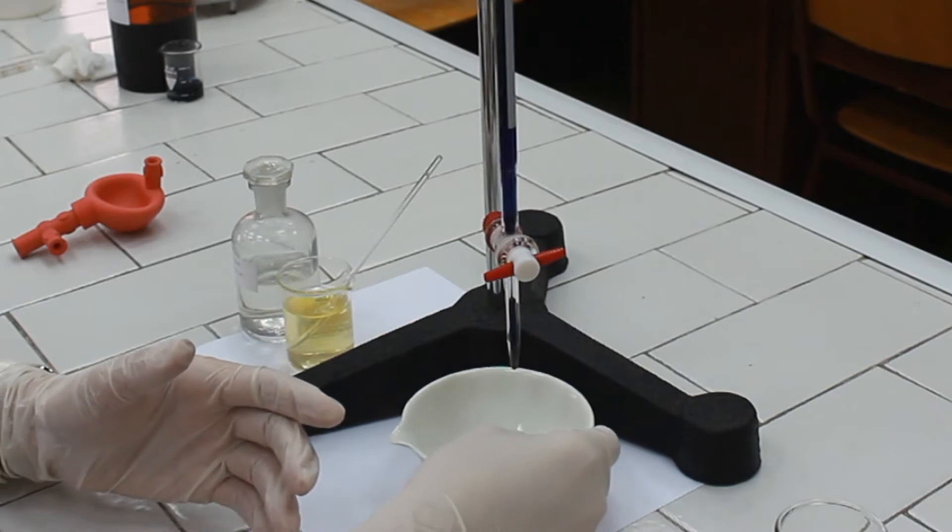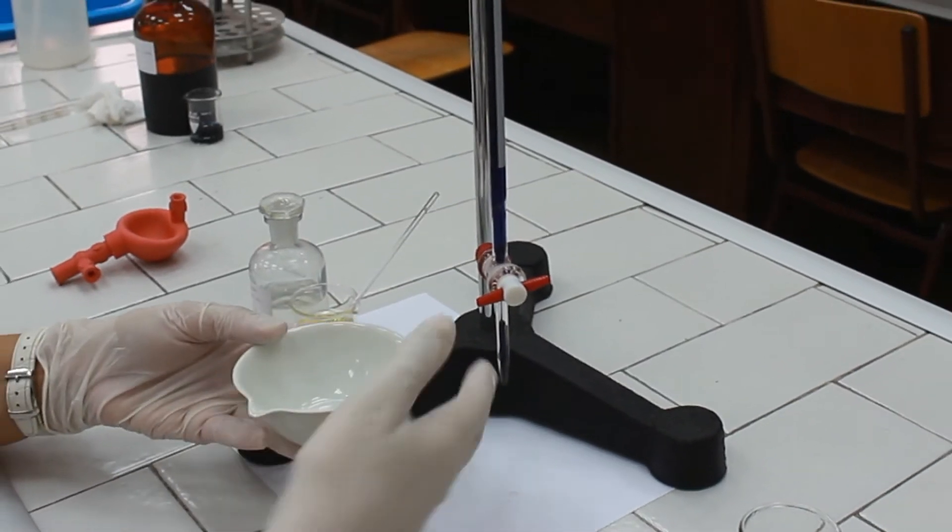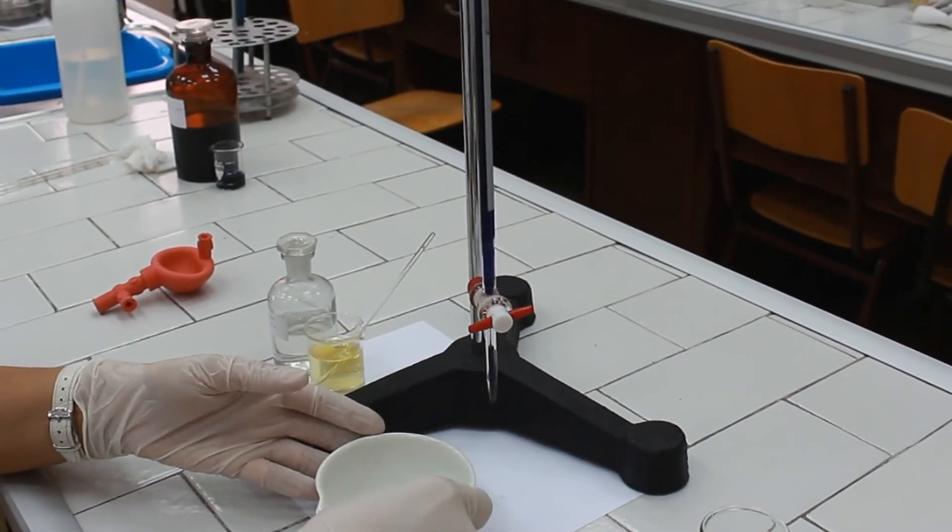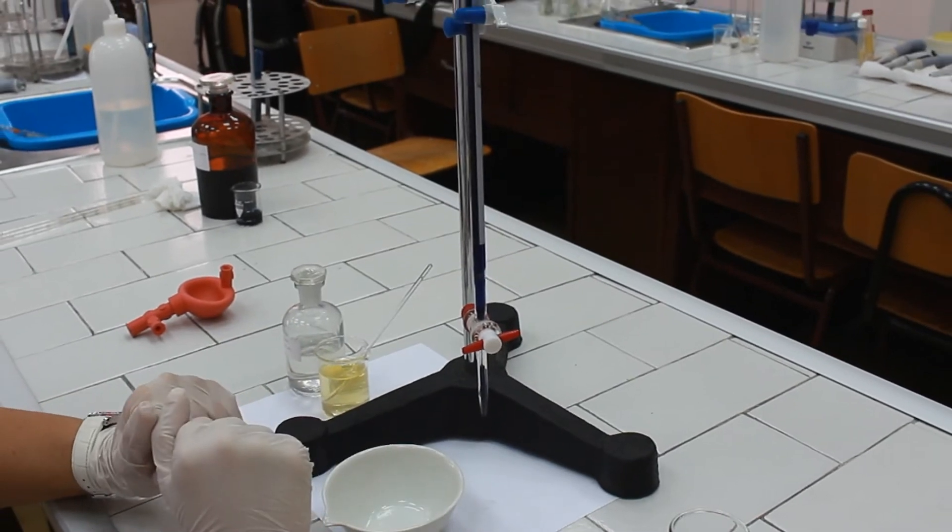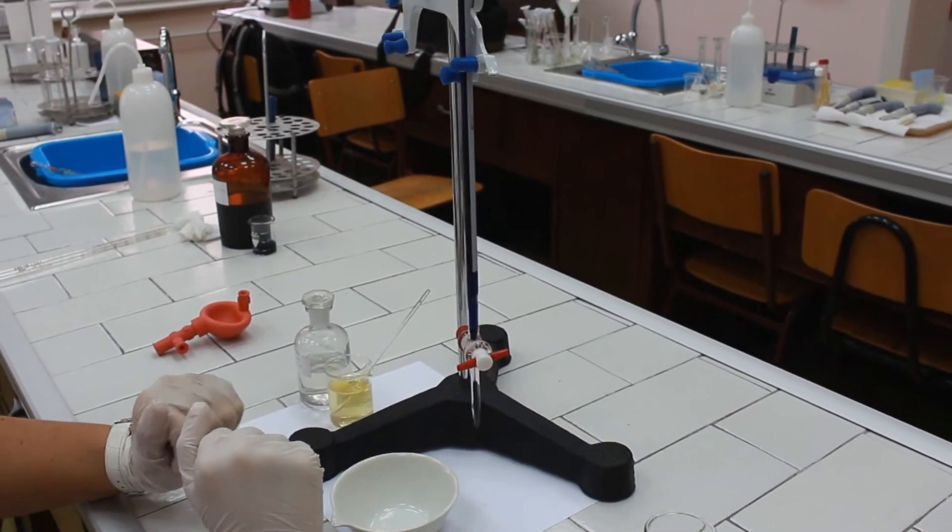For the determination of vitamin C in a urine sample, we need a ceramic dish to which we are going to pipette 2 ml of urine.